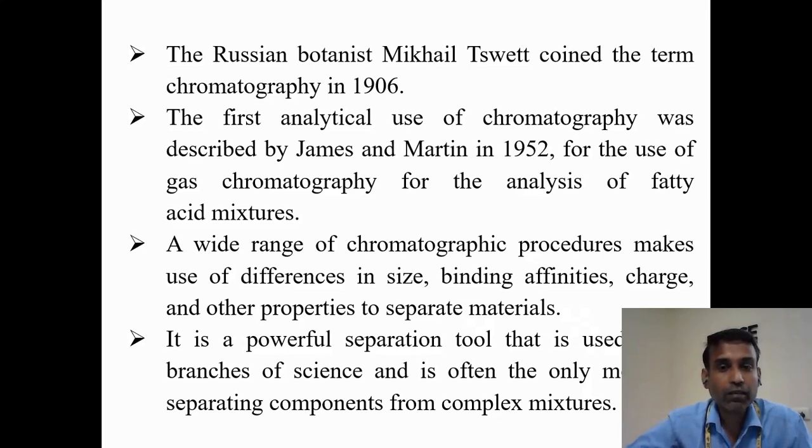It is mandatory to sell our product in the market. At the same time, to assess the quality of the food product, it is necessary to perform food analysis. See here, also for the sensory attributes. So these are all the main reasons why it is important to carry out food analysis. So here we will discuss the chromatographic techniques.